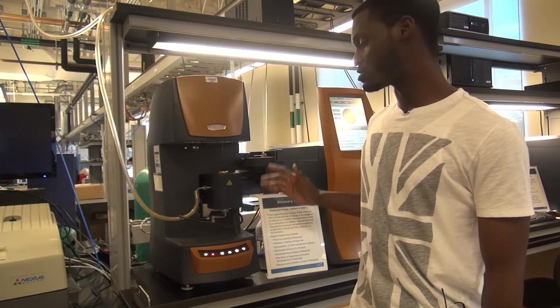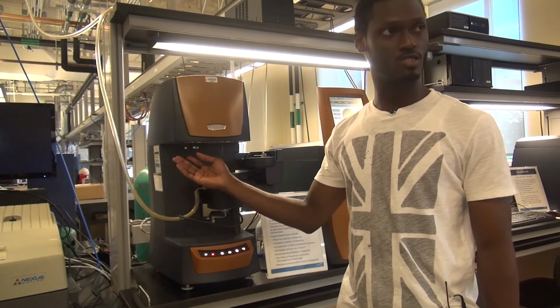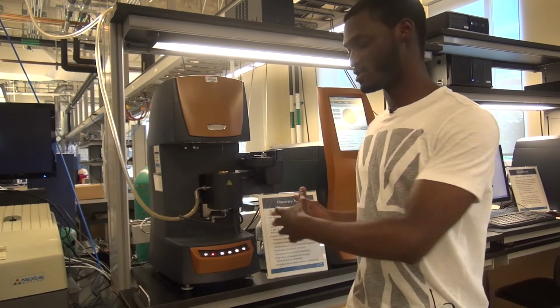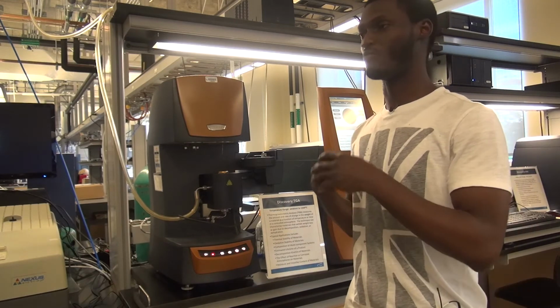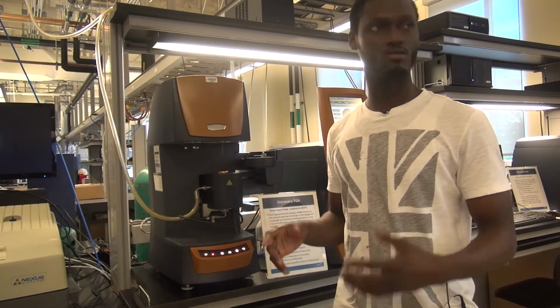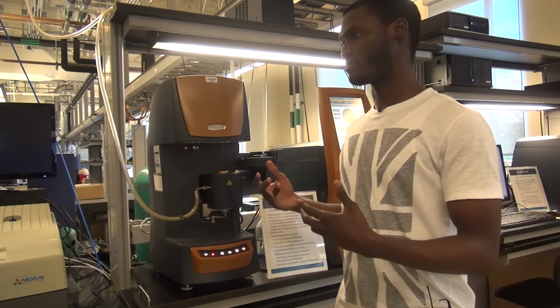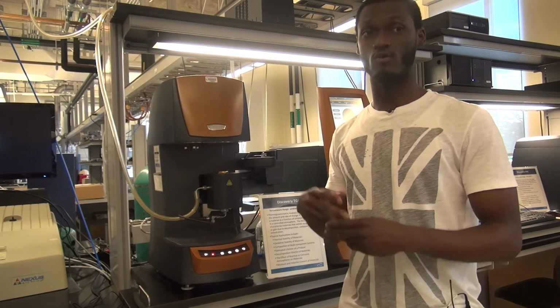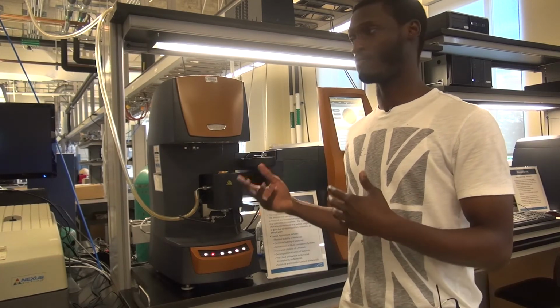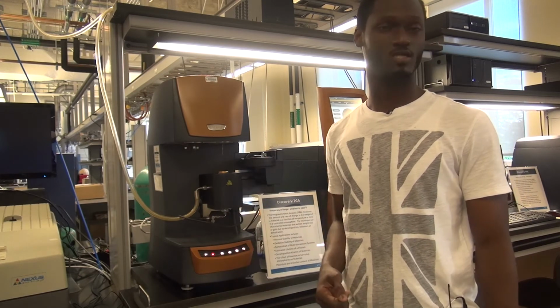Again, if you are using the pans that we have provided, generally you don't need to change your reference pan because these are all platinum pans. So those relative differences aren't going to matter very much. However, if you are going to use a completely different material, for example, aluminum oxide or aluminum, they will then require you to change this reference pan to that specific material. All right.